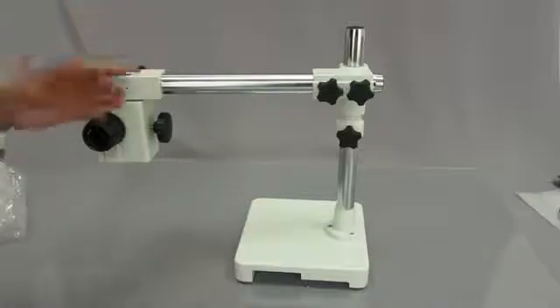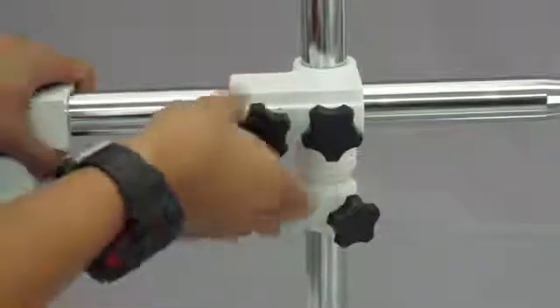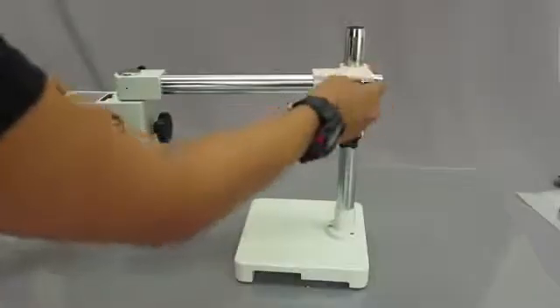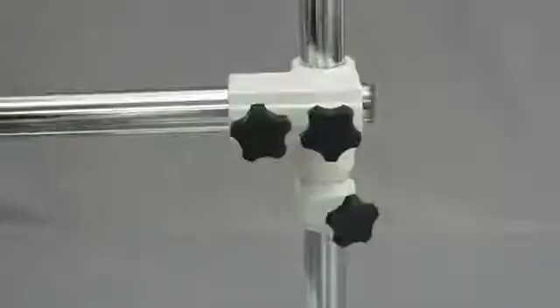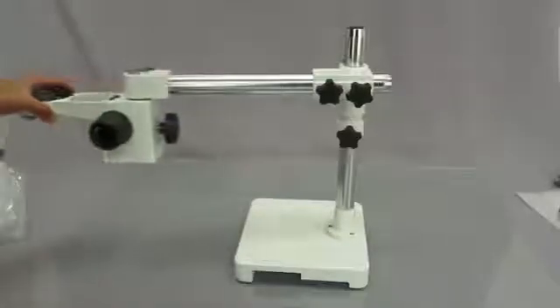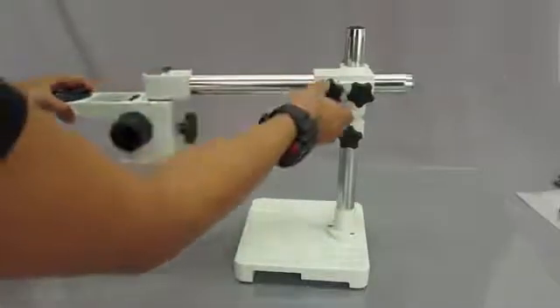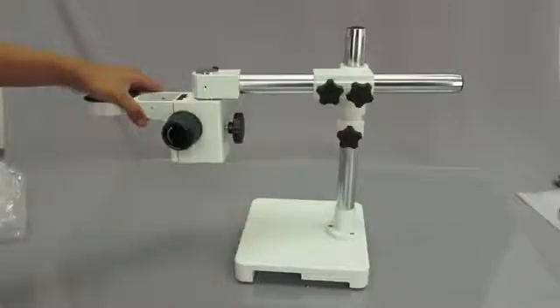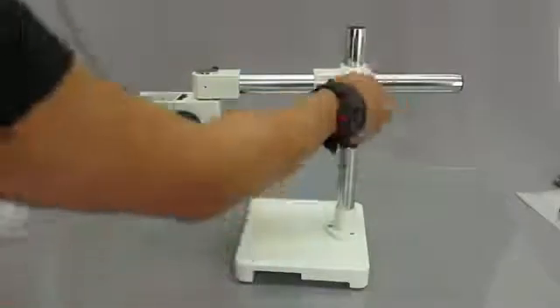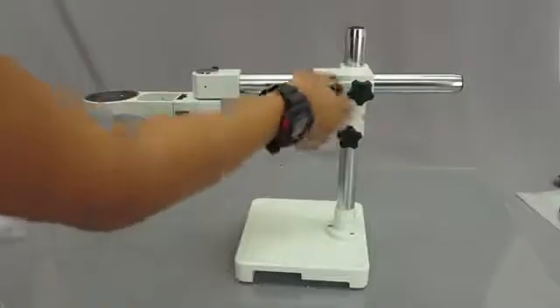Now if it's too far out and you want to move it back in, all you have to do is unscrew these knobs here. And this will allow you to easily glide the arm of the microscope left and right. And as always, if you want to stop it from moving, just tighten these parts here, 1 and 2.